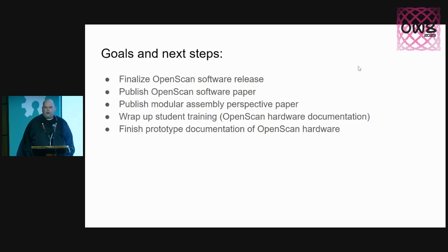And so part of being truly open is capturing the expertise and memory of a system, and we were missing that. So we think our field needs to go beyond, in our journals and articles, just being open hardware by saying, hey, this is a plan on paper. Here's the parts list you need to build it, and describing the parts, which is almost all we ever do in the microscopy world. We got to go beyond that. And so that really led to this idea of trying to capture the process of the complex assemblies and the expertise that is needed. And I'm very grateful because we wouldn't have been able to go down this road if it wasn't for Oshawa. So with that, I will end and let you guys get lunch.